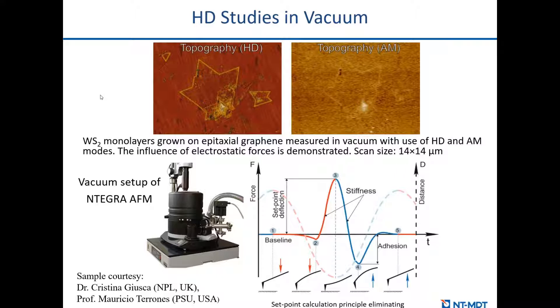In some cases, it's not possible to get good imaging in tapping mode, and using contact mode damages the sample — so the compromise is using hybrid mode. On this slide you can see the example of hybrid mode applied to tungsten disulfide monolayers in vacuum conditions. Our AFM can be operated not only in ambient conditions but in controlled gas atmosphere and also in low vacuum down to 10⁻³–10⁻⁴ torr. In this particular case, the topography was very blurry because of huge surface potential of the sample, and contact mode was cutting these flakes. The only way to get the image in vacuum was to use the hybrid mode.